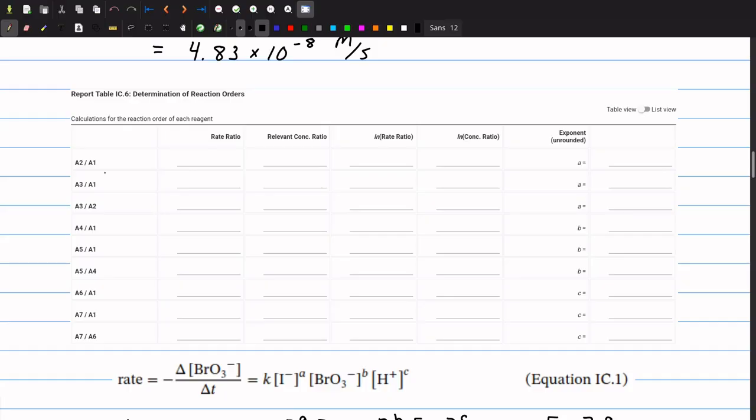And then you're going to repeat that the whole way down. Again, this is a good time to maybe bust out the spreadsheet. Make sure you keep it straight which ones you're doing for each one of these. And you're going to be able to fill in 3 values for A, 3 values for B, and 3 values for C.